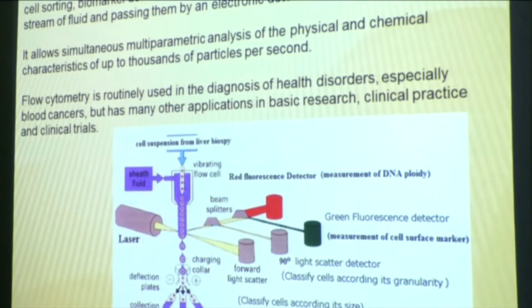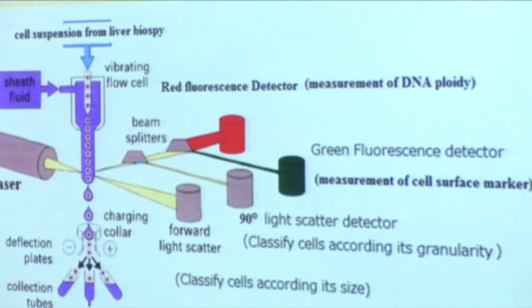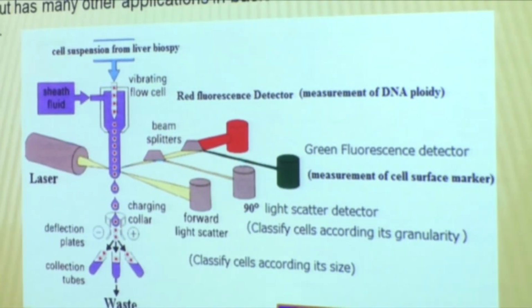Next, flow cytometry. Flow cytometry, what is this? Very simple.